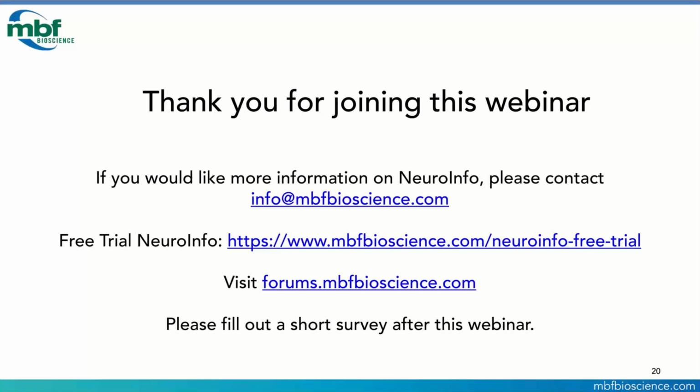One of the things that we want to emphasize is that the output of this program provides the coordinates for neurons that have been marked in a brain, and puts them in a table in a format that has the coordinates in the Allen space. The power of this whole technique is that you can take data from different brains, and because all of the data is put into the same common space, you can compare labeling or compare the distribution of neurons from different brains in the same space.